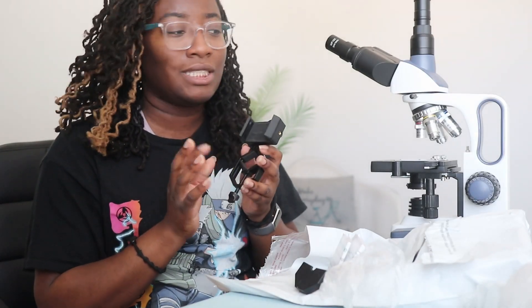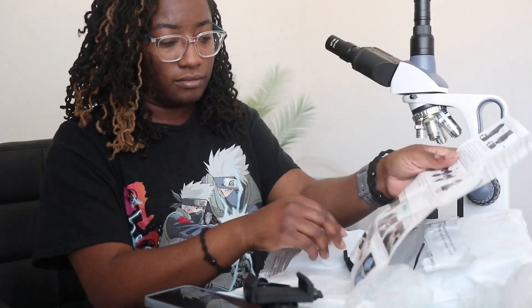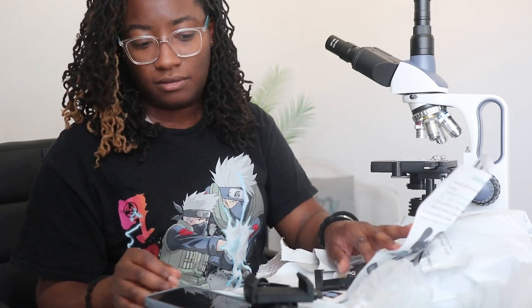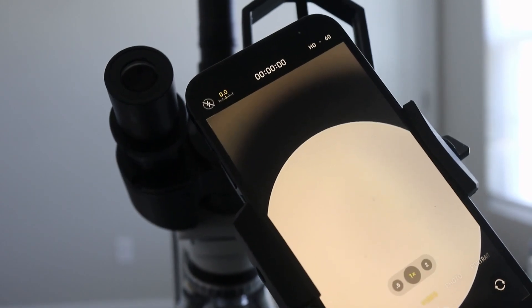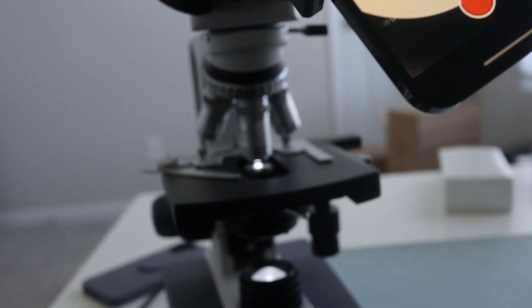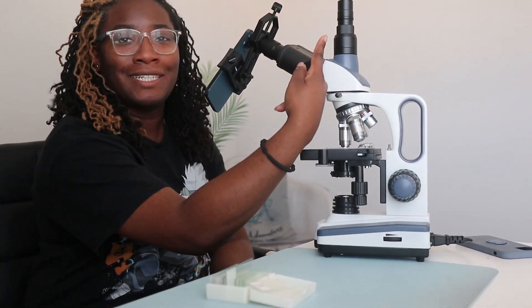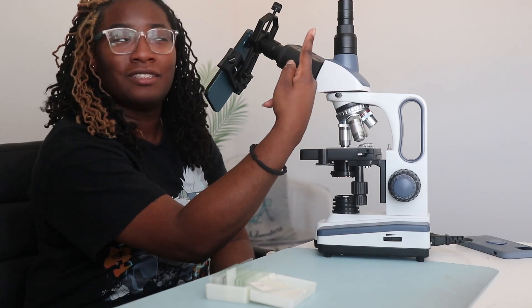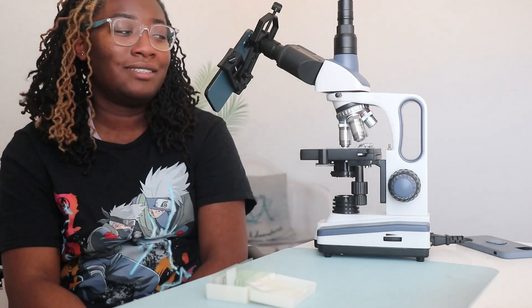I have to figure out how to rig this up so I can use my phone. After a lot of work off camera, I did get my phone mounted. It's not in the greatest position — I wanted it on the trinocular lens, the third lens, but my phone just isn't working with the wide field 25x. I'm thinking I'll just have to play with that later.